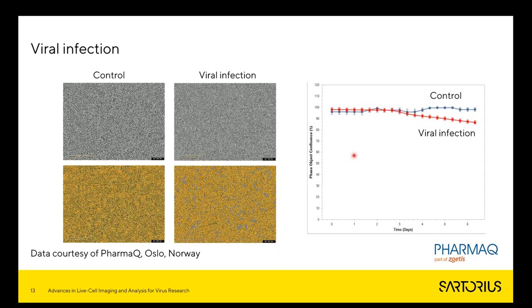This difference is basically 10% in this experiment, which seems like a very subtle difference, but it can have a major impact in this research, as it gives more insights into this assay that you would otherwise miss by just using your eye to assess the differences. Also here, you can see that there are some plaques forming in the image. These can actually be quantified by taking a negative impression of this mask. This is a benefit of the Incucyte, as we don't use proprietary file formats.